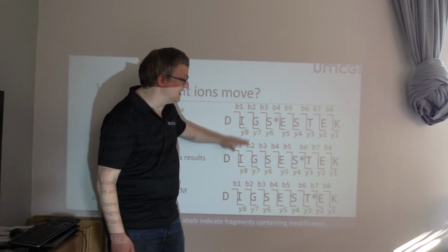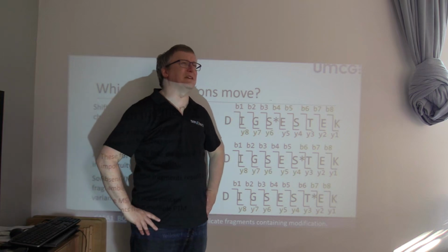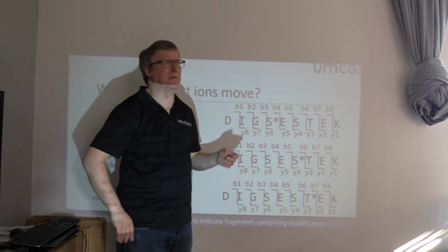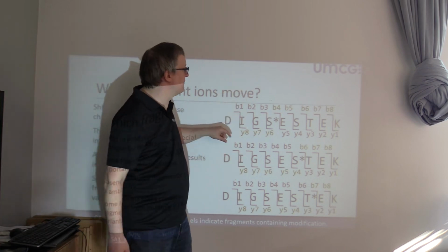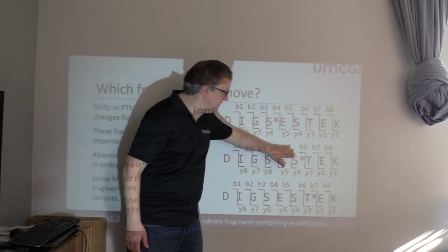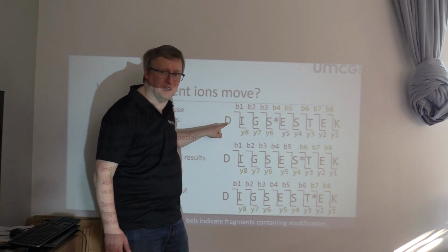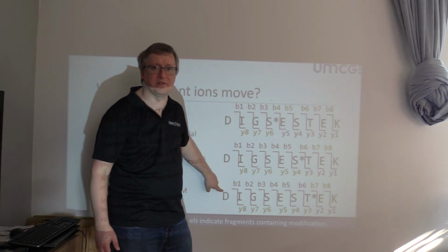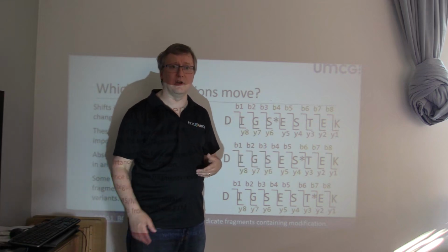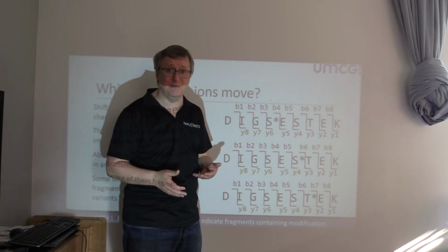The next piece is, is there a very slightly different mass if phosphorylation is connected to a serine than to a threonine? Okay, well, maybe not perfectly identical, but anyway, in this case, we also have the same mass for the modification in each case. Now I would ask you, do these three peptides that differ only in where the phosphorylation is attached, are they going to separate in liquid chromatography using C18 material?